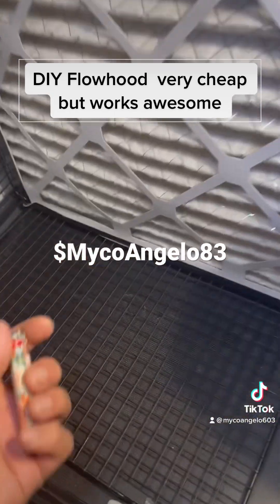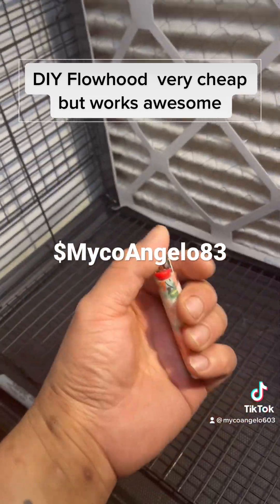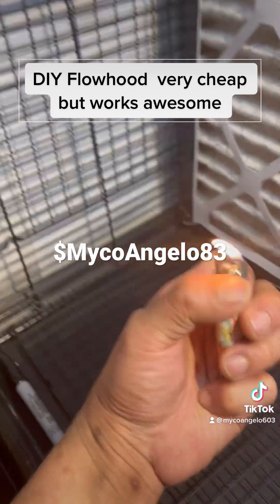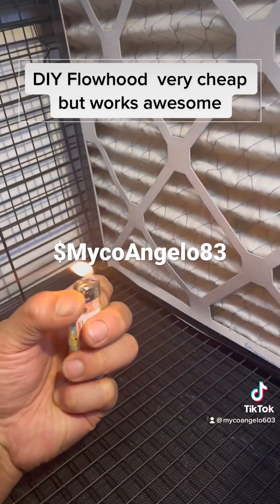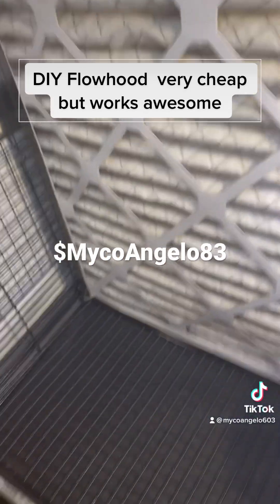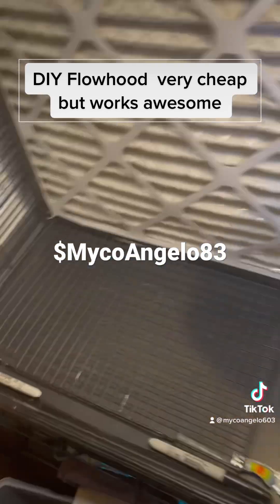This is how you can tell if you're getting laminar flow. If you use a lighter, the flame goes at a 90 degree angle. Check it out — see that? See how the flame goes at 90 degrees? That's how you can tell you're getting clean air. That's what I'm working with. It works for me; it should work for you too.